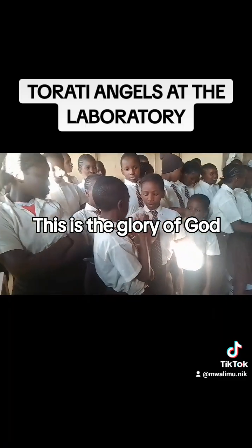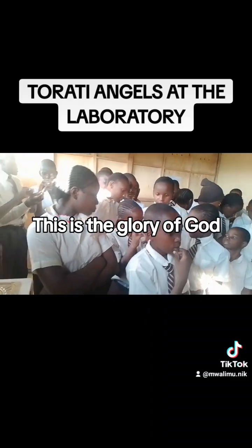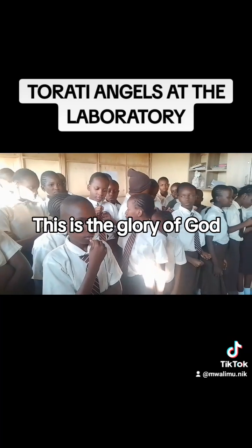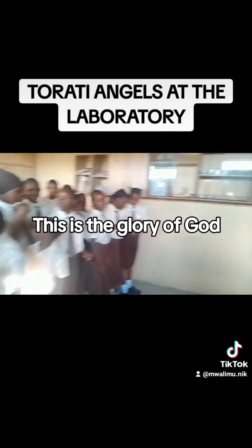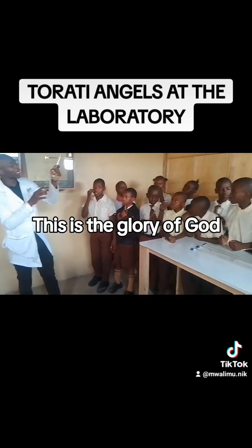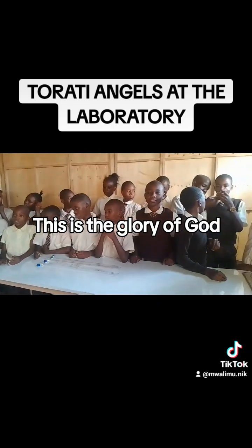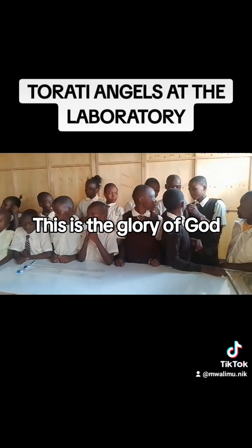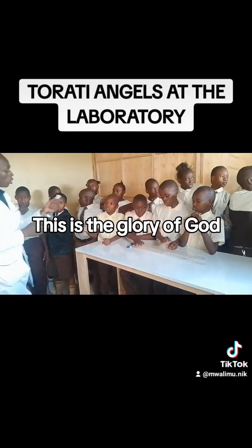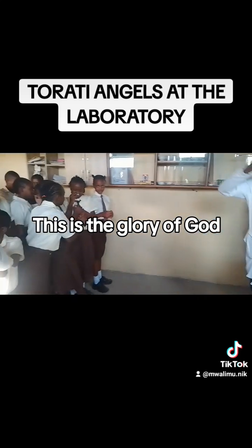It is also an instrument that is used to measure volume. So we can measure volume by using a volumetric flask. When you observe the level, it has been rated 200 milliliters, 250 milliliters. It also has a cork. This one we call a cork stopper. Once you pour the chemical inside, we use the cork stopper to seal.